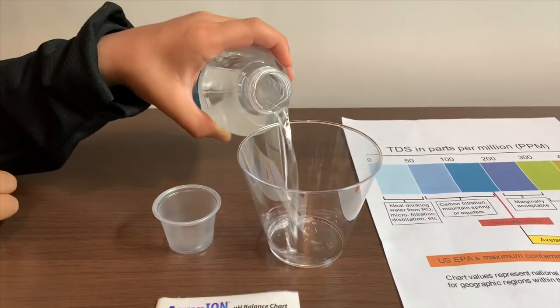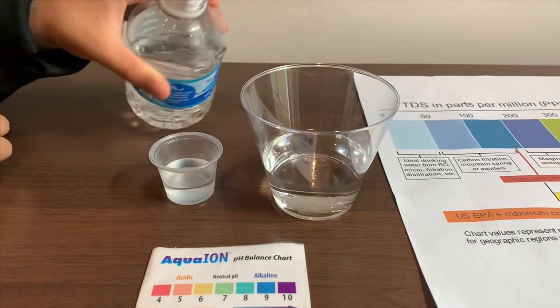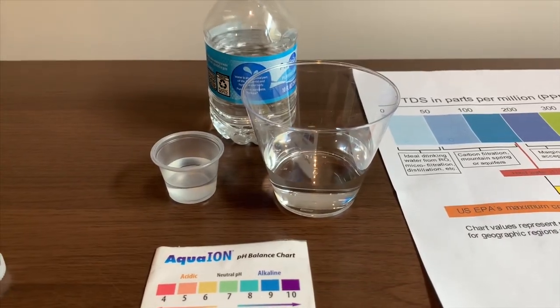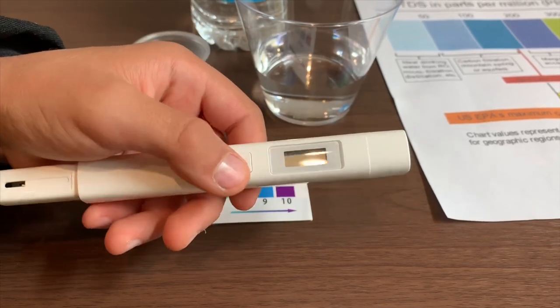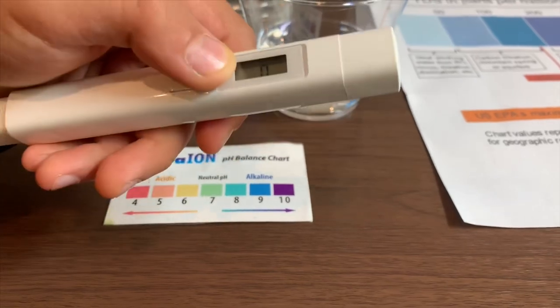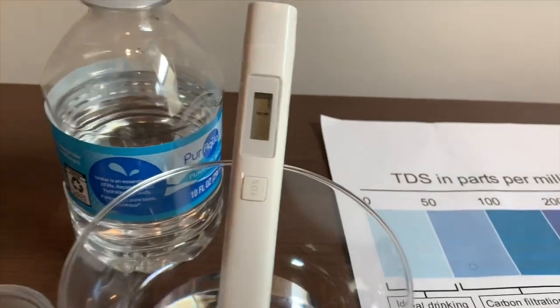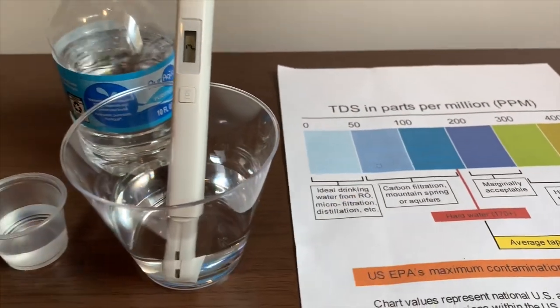Let's pour some water in. First, let's test the TDS level. If you want to buy this TDS tester, check the link down below. Turn on the TDS tester, make sure it says 0, and put it in. That is ideal drinking water.